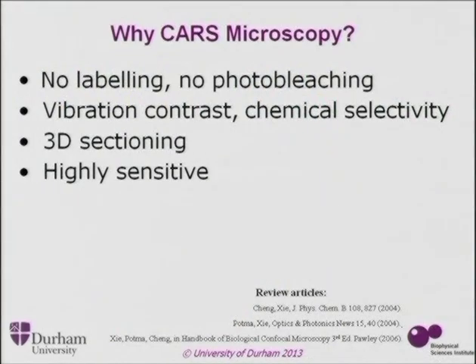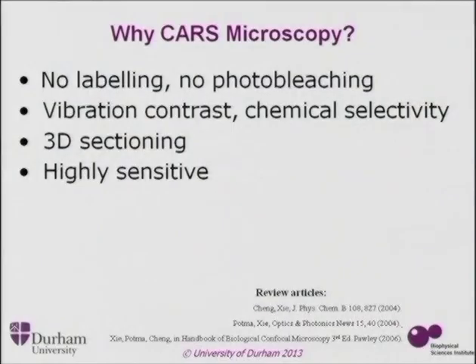So why might you want to use it? Generally, there's no labeling. There's no photo bleaching. We've got no fluorophore in there. You've got contrast due to the vibrations and due to the chemical things, and you can get 3D optical sectioning because it's non-linear. It depends on the intensity of the light raised to powers. So CARS is, again, another very powerful method.